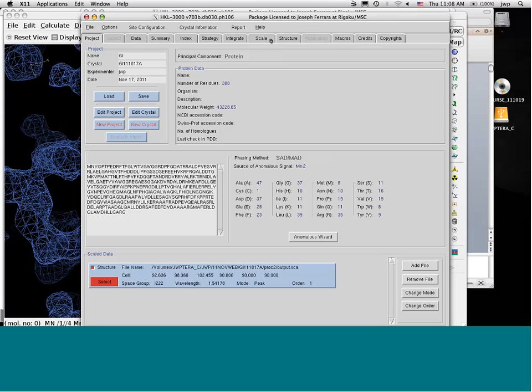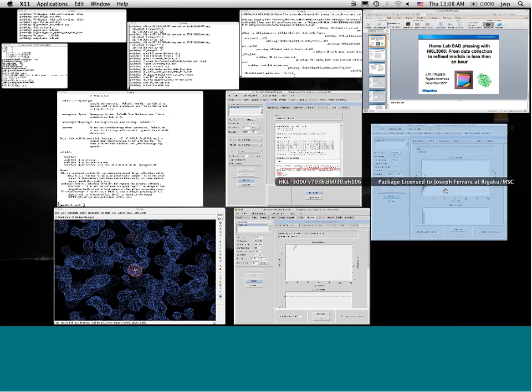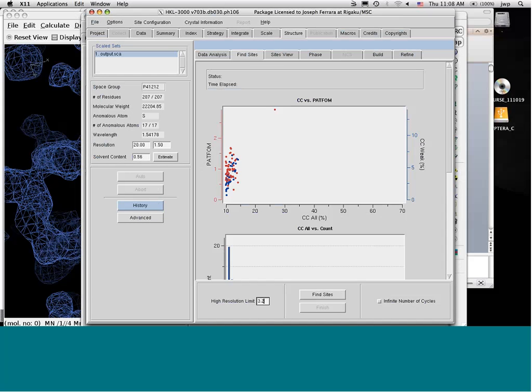To go back to here, you asked, how many of these were right? Probably all of these are close enough to be solutions, and there's like 5 of them there out of 33. So more than 20% were right. That's a lot different than this guy, which is the thaumatin. I did stop it early, but it's one site here. So you just try it. And what I would recommend that people do, and some people don't have time to do this, is to grow a thaumatin or a lysozyme crystal and get some experience that you can apply to your own protein.